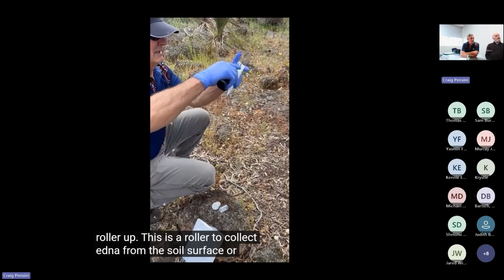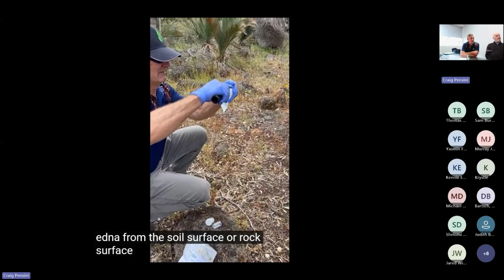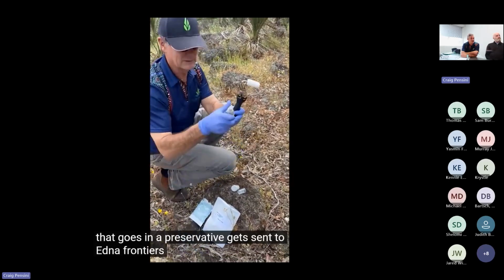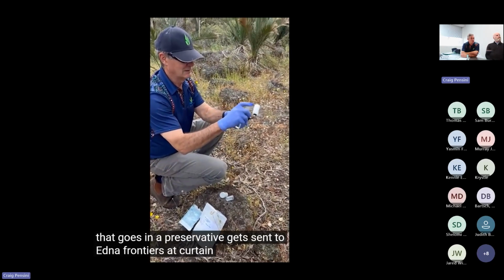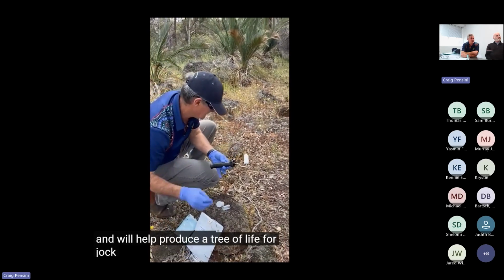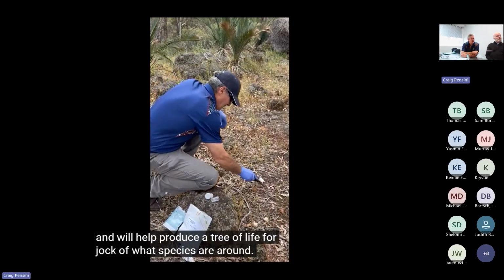And we don't want to be touching any of that, even though we've got gloves on. We're going to try to avoid touching that with anything. Then we moisten it up so it is able to grab as much material as possible.